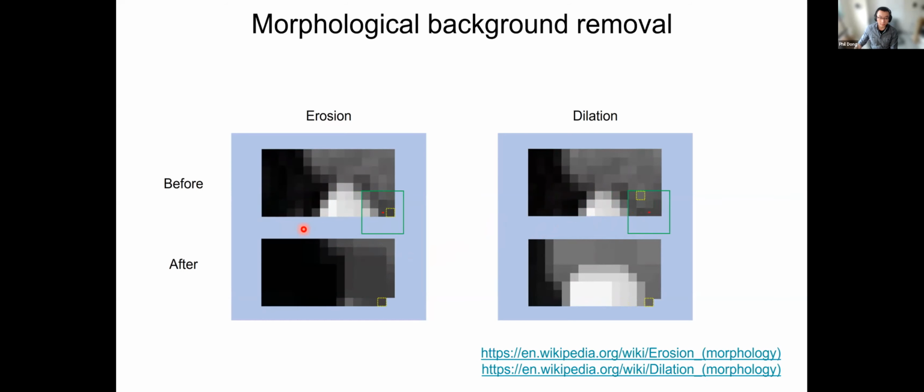And you can see that when we use a kernel size that's too small, you sort of artificially reduce the size of cells because it basically functions as a size filter. So if I try to play this, you can see that when you zoom in, the size of these cells is reduced by some amount, which is not a true reflection of what's going on.